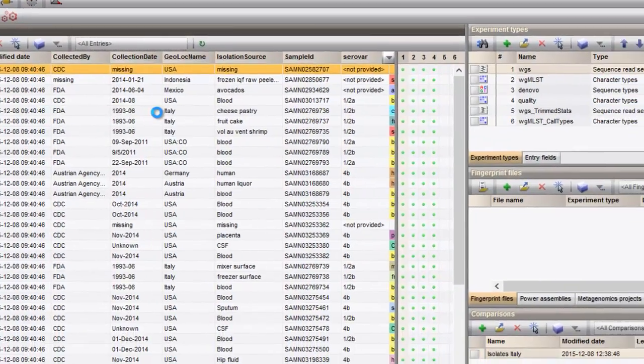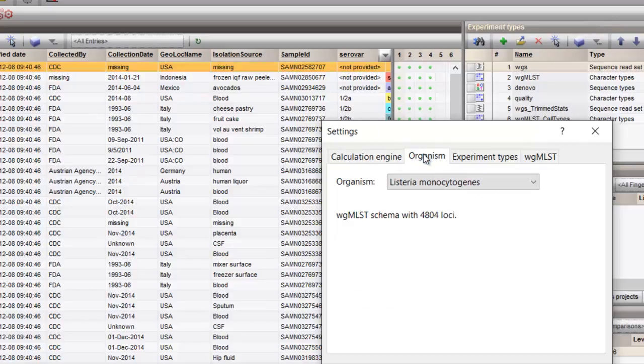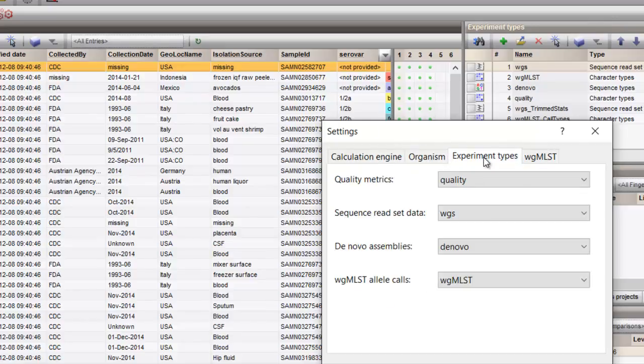The other tabs provide information on the organism, the experiment types and your lab ID for allele submission.